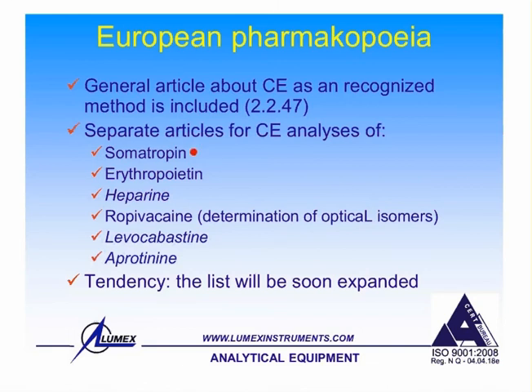Right now, there are several separate articles on how components like somatropin, erythropoietin and so on can be analyzed using capillary electrophoresis. So I would say it should be analyzed by capillary electrophoresis according to the prescriptions of the European Pharmacopoeia.